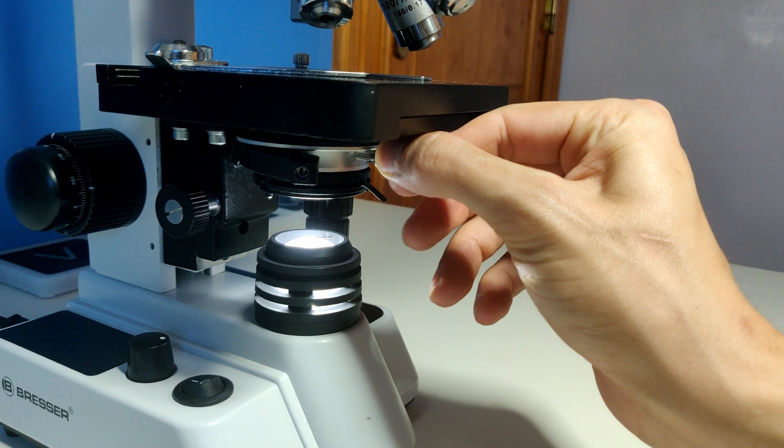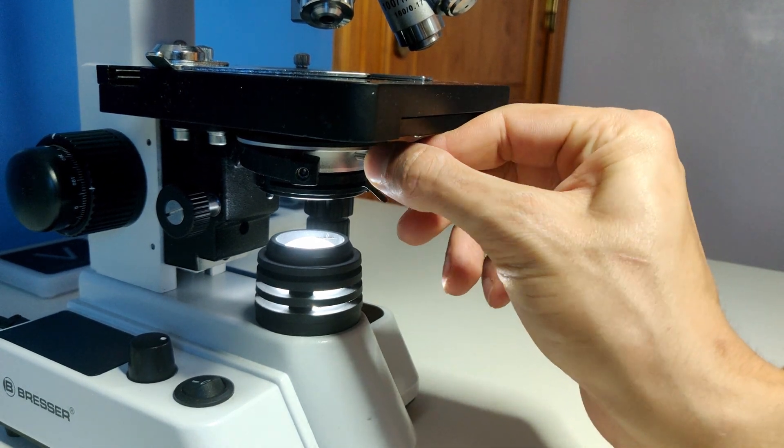If the hexagonal image is not nicely in the middle of your field of view, you can move the image with the two screws under the stage. You only need to perform this step once per session. Once the image is properly centered it will no longer shift when changing the lens.